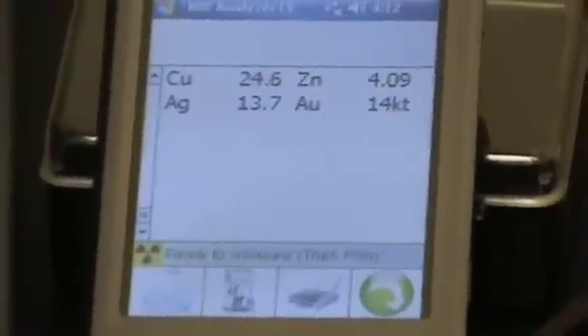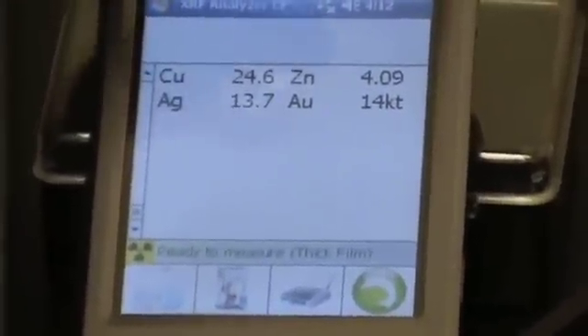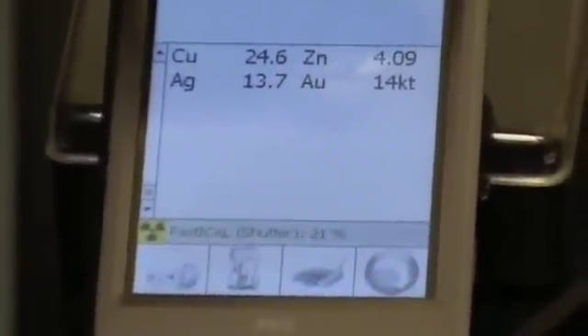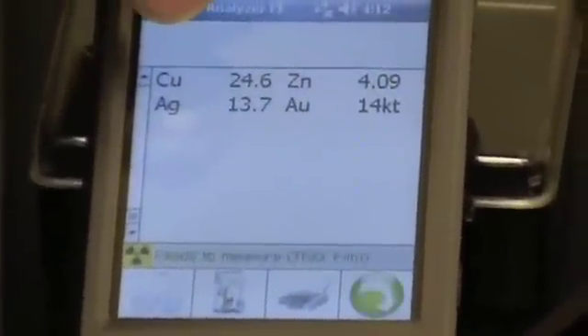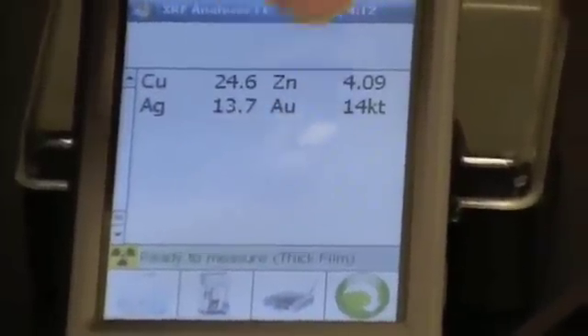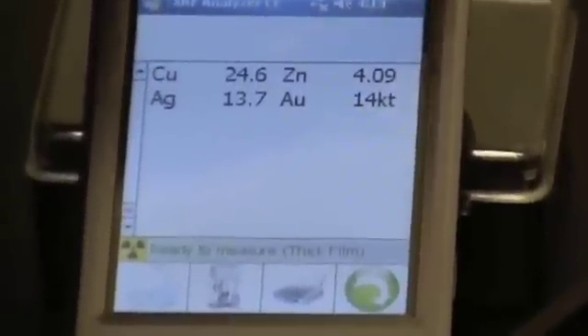Its composition is once again copper which is CU at 24.6%, zinc at 4.09%, silver at almost 14%, and it's testing out at gold at 14 carat.